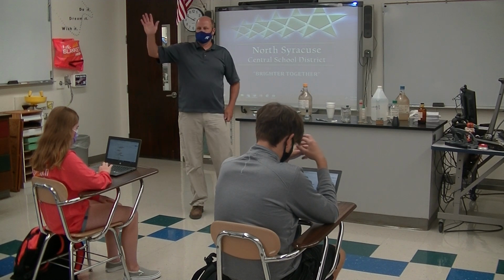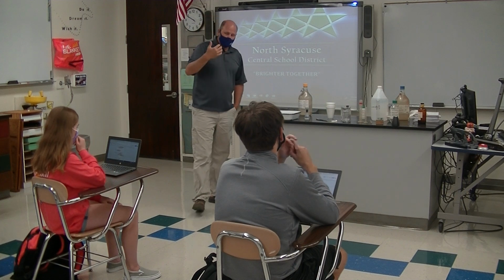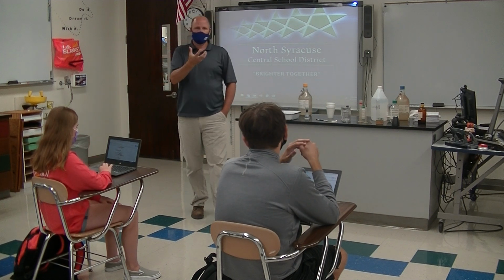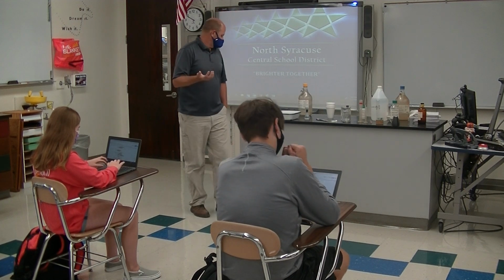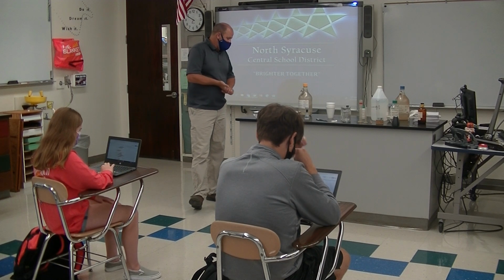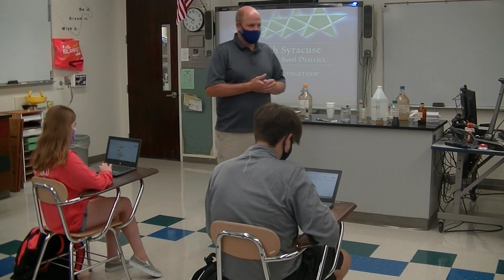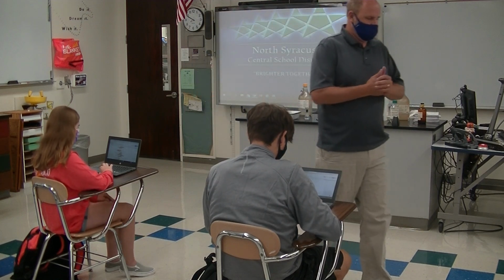How do people like the smell of gasoline? Like organic solvent, you love it. So does everybody else hate the smell of gasoline? It's usually one or the other. It's usually not I can deal with it. Many of the organic solvents have a smell, good or bad. Some people like the smell. Some people dislike the smells. Some people are more sensitive than others. So organic solvents may be ingested. So no eating in the lab as well. You're going to have two answers that say no eating in the lab.